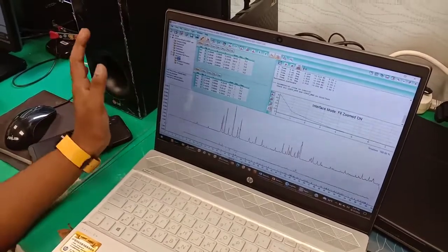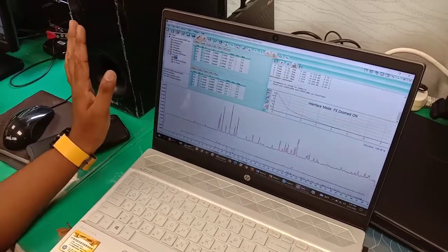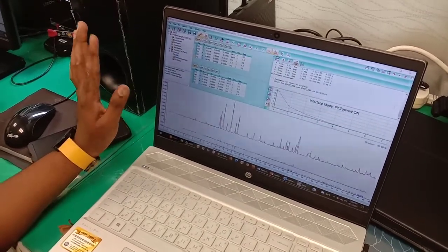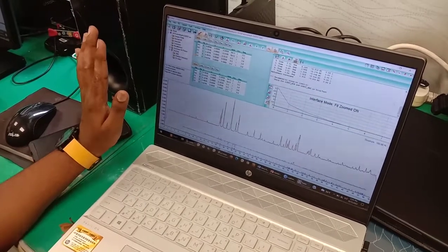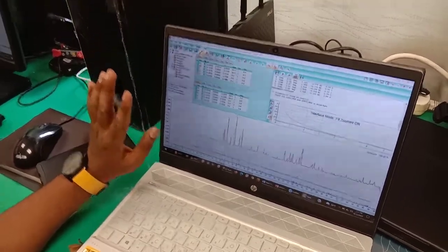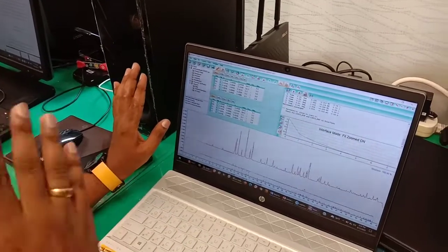Those sites should not be refined. They are fixed sites. Sometimes we also have to look for some kind of relationship. For starters, the XYZ should not be negative. Basically it should be from 0 to 1.